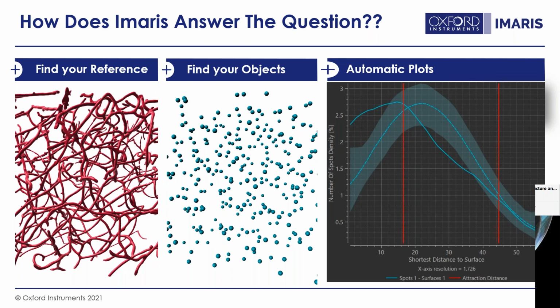This type of work is definitely happening within the biological world, but it's one of those things that's more difficult to do because no one software can take you from a raw image all the way to these plots, at least not in 3D and over time. And so now we're offering that here, and it's all completely automatic for you.